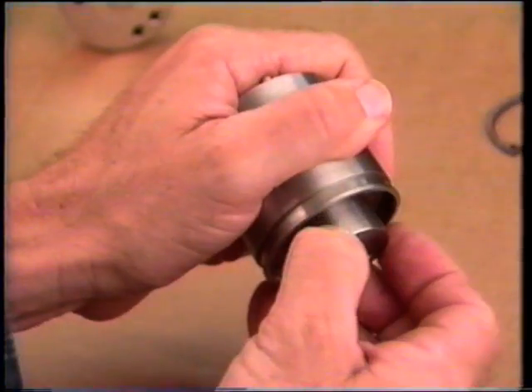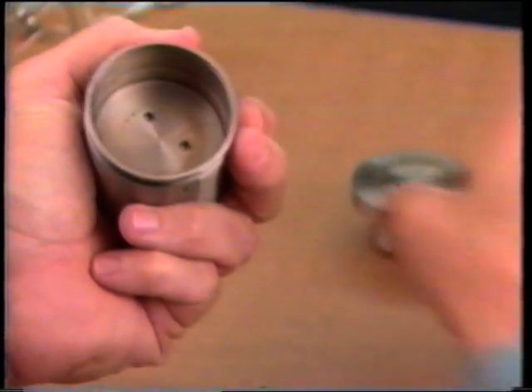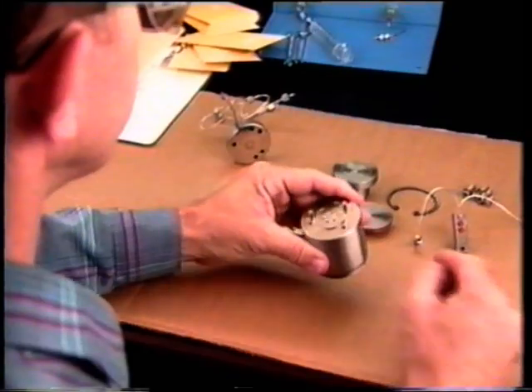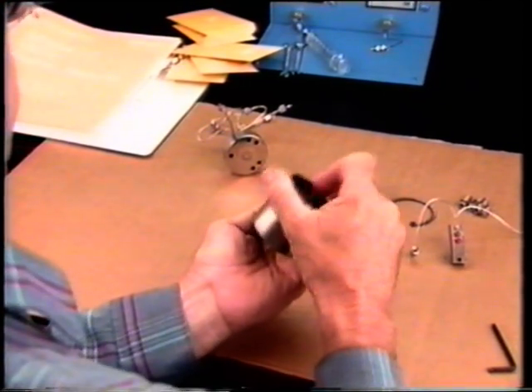Next, remove the retainer base, compression plate, compression spring, and compensation plate from the bottom of the valve body. Use pliers to remove the pistons. Since the plungers were not removed before the pistons, push them out from the bottom. Clean and inspect the valve body pistons.